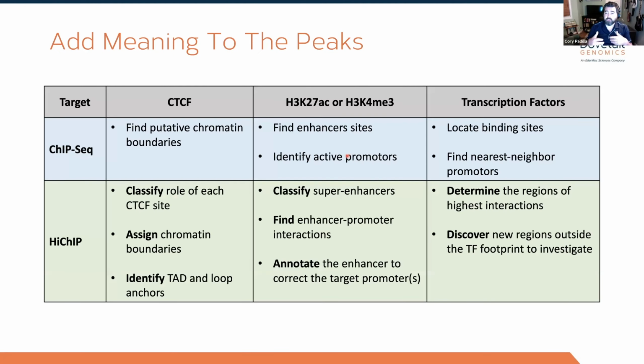If you bring in that 3D interaction, you could say, okay, this footprint actually interacts with something that's 15 kb away. What is that? And it gives you an ability to discover new areas that are linked with that transcription factor.